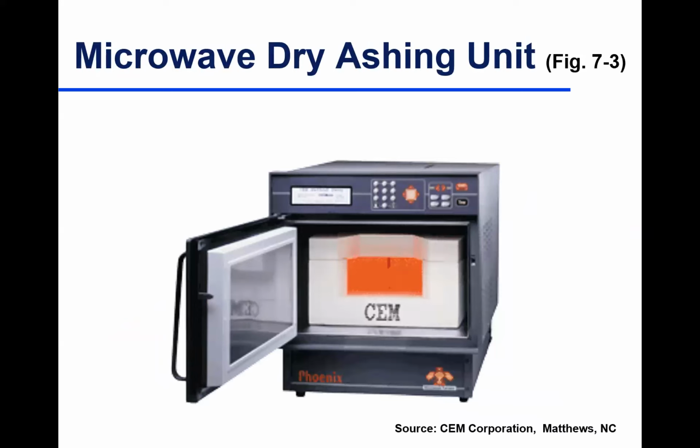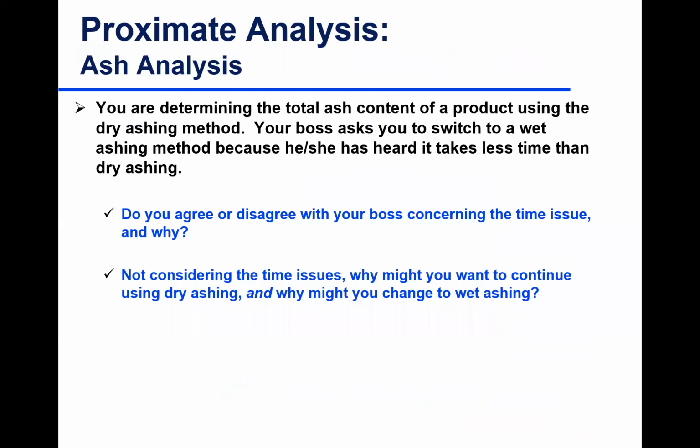So dry ashing would be similar to your dry ashing using a regular muffle furnace. Here you get results in minutes, potentially 4 to 20 minutes, depending on the sample that you're analyzing. So that's the benefit of that time, but it's not yet an official method, but there are a lot of comparative studies that the book chapter talks about.